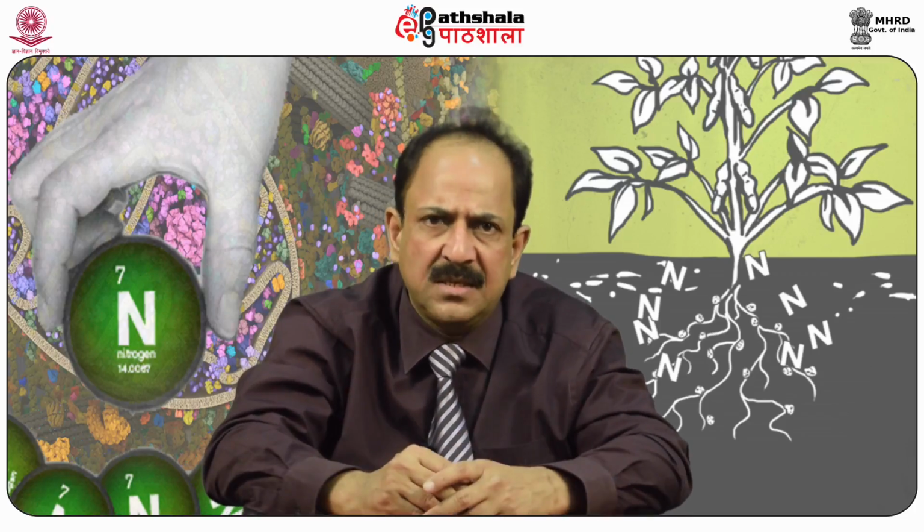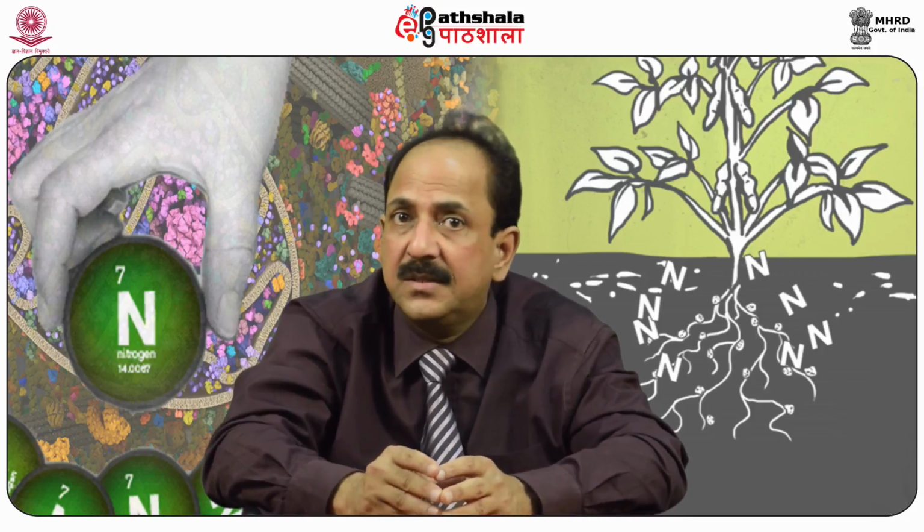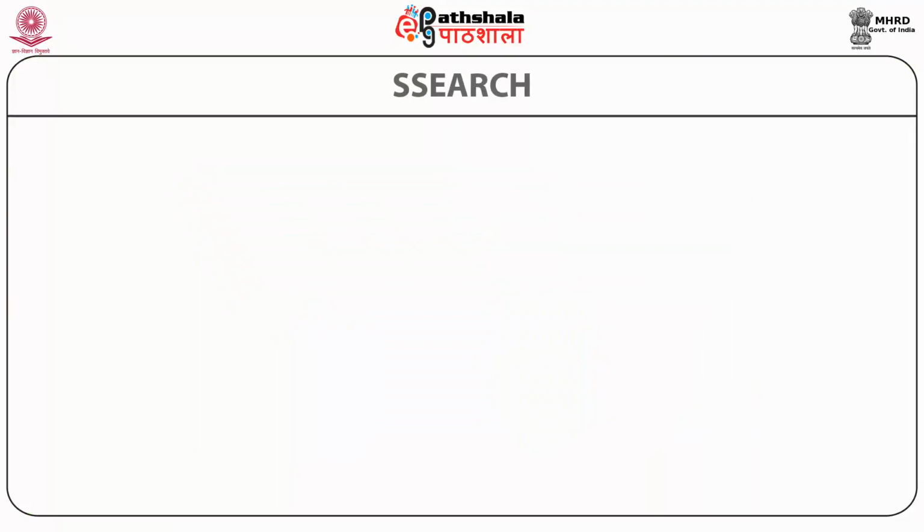When the divergence distance is not known or the sequences have intermediate divergence, choose BLOSUM 62 with 10 for gap opening and 1 for gap extend penalties. Alternatively, try all the 3 options to arrive at 3 alignments to select the best one. Now submit for sequence alignment.